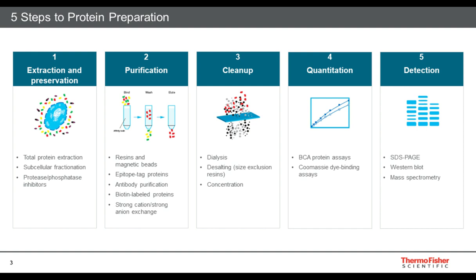During the extraction process, cellular compartment integrity is often compromised, potentially exposing your protein of interest to proteases and phosphatases that are normally sequestered elsewhere. An essential component then of any lysis buffer formulation is a mixture of protease and/or phosphatase inhibitors to preserve the integrity of the solubilized proteins, as well as preserving any labile post-translational modifications that may occur naturally in situ.